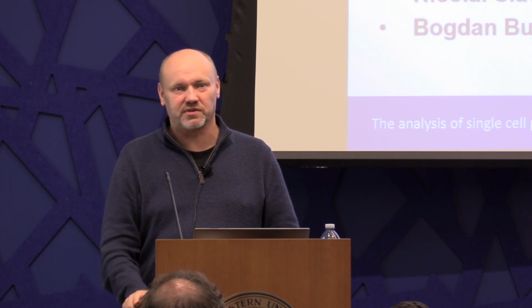So you can work with uncalibrated instruments. But I guess the fragmentation really depends a lot on the collision energy and your settings, basically. So, MaxQuant would read it out automatically? Yeah, it would read it out automatically. And then readjust deep mass based on this? Yeah, exactly. It would just need to be fed in as one of these metadata parameters.